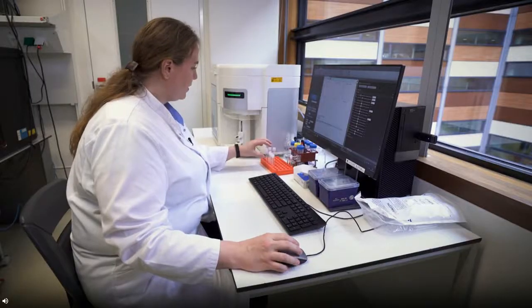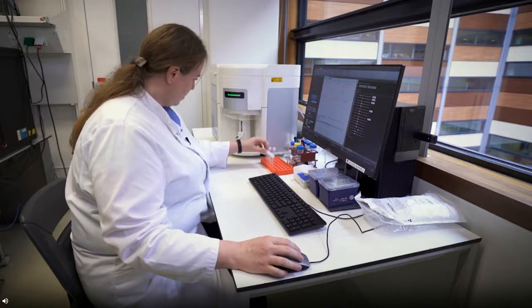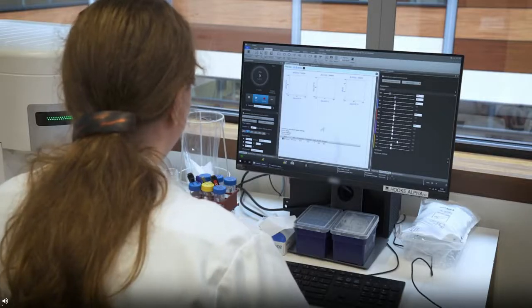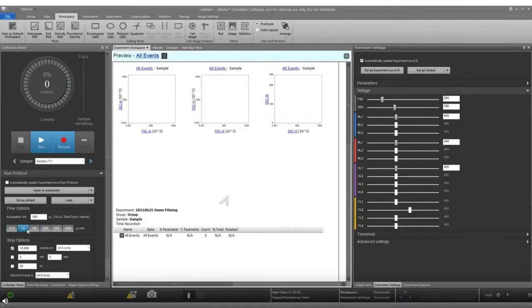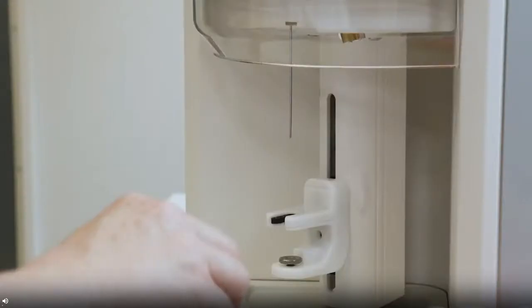So the next part I like to show is the fact that we also have these set volumes here, or set flow rates here, and we can use any variable volume between 40 microliters to 4 milliliters. So first I'm going to actually grab an unstained here.